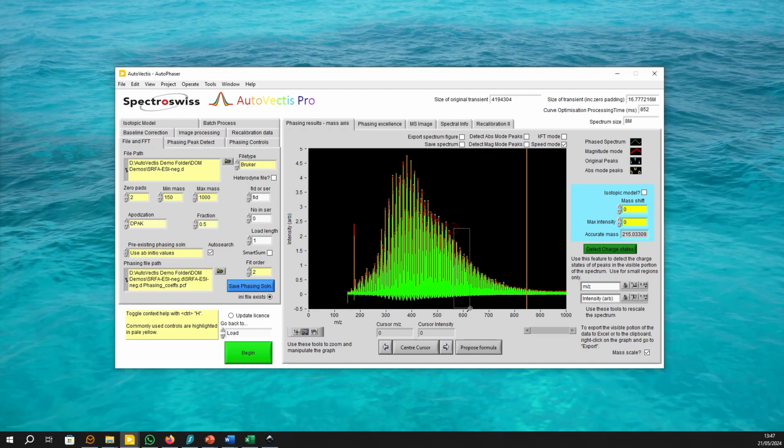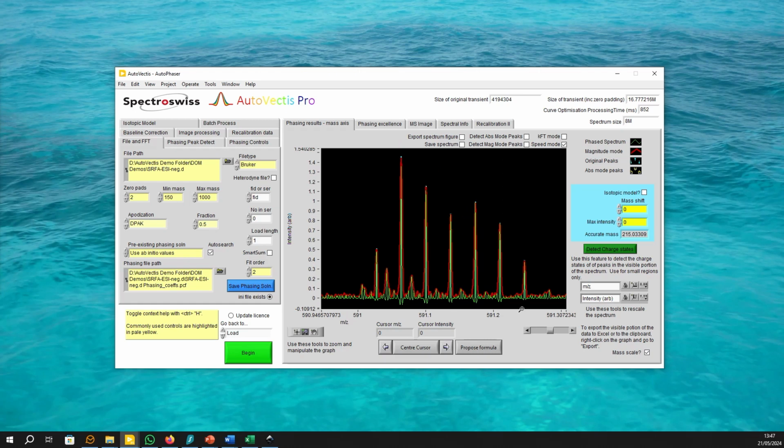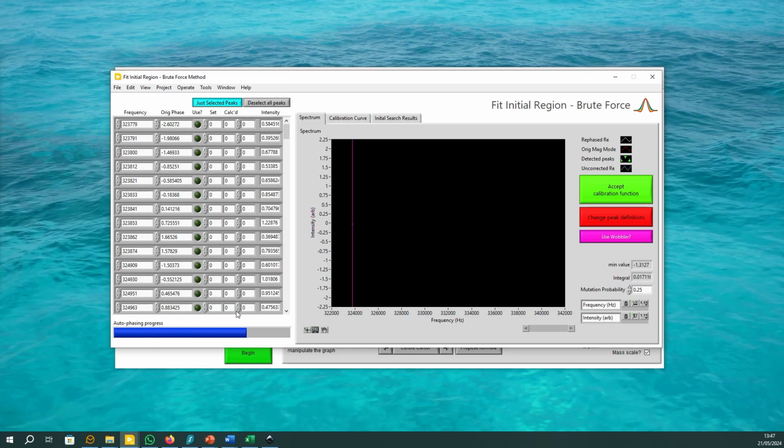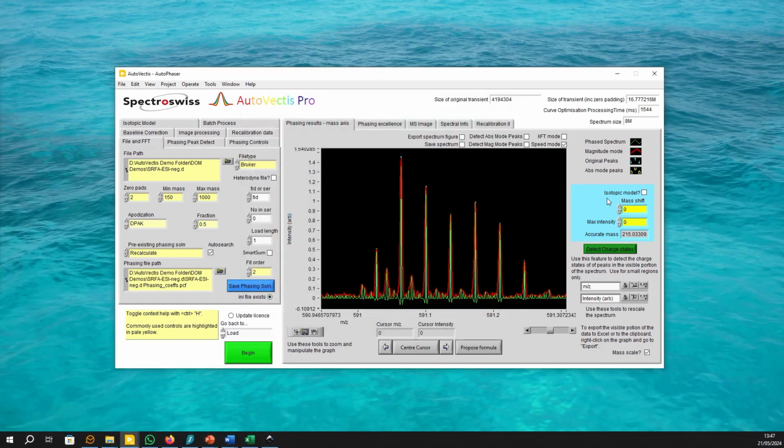As you couldn't see any change in the spectrum, we need to zoom into the details so we can show that either of these routes really are equivalent. So we'll keep this view constant and I'll reprocess the data again in the recalculate mode. Once the begin button has started flashing again, that means processing is finished, and even in this zoomed in view, we couldn't see any difference between the spectrum processed by the recalculate route versus the one reprocessed via the ab initio route.